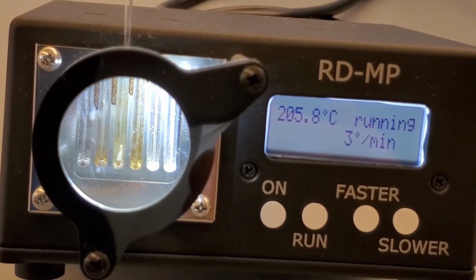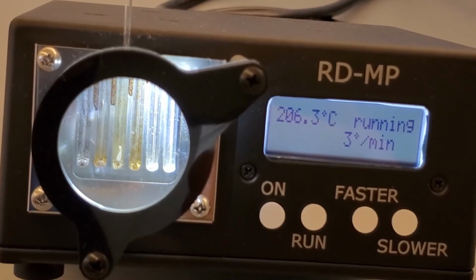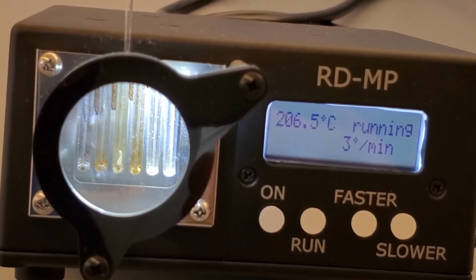We have officially reached the melting point of borneol without observing melting, and our product is almost gone.